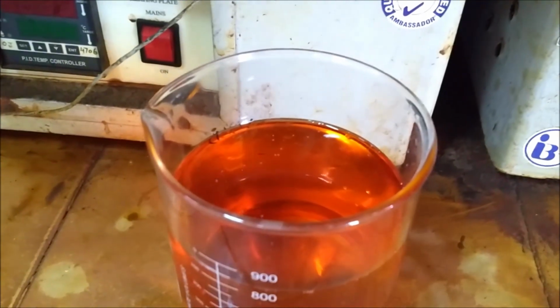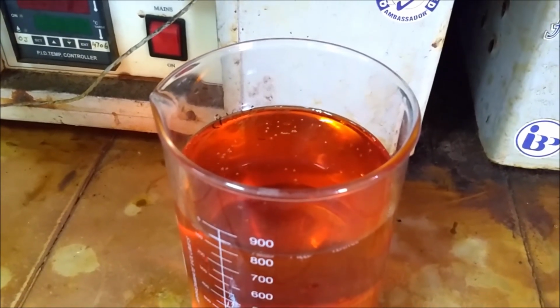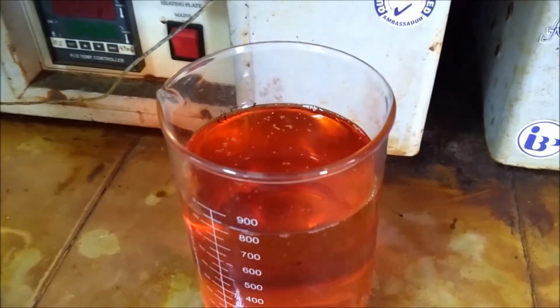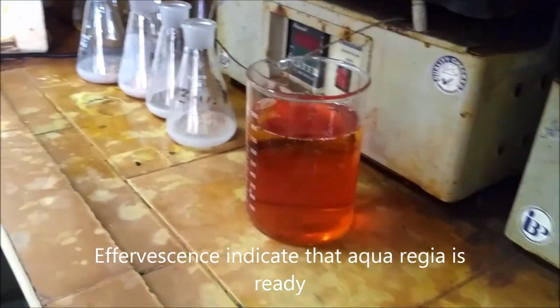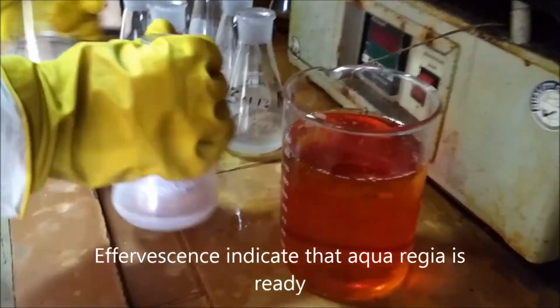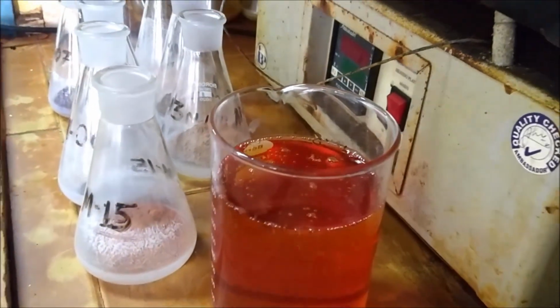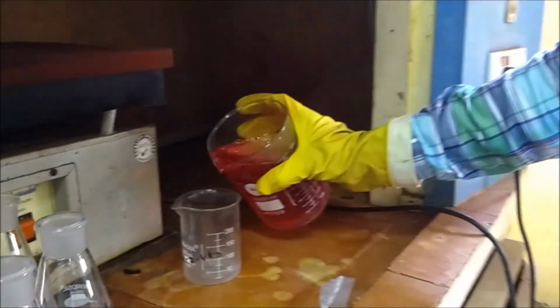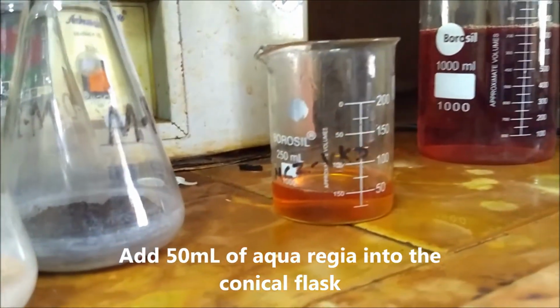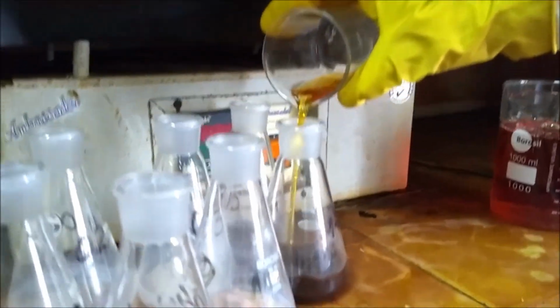After some time there is effervescence and bubbling. Now you can see that some bubbles are there. Now it's around ready to add in our samples. Now we will transfer 50 ml aqua regia to each conical. Now you can see the effervescence in aqua regia. Now with the help of a small beaker, because it is very convenient to use, we will add 50 ml each.